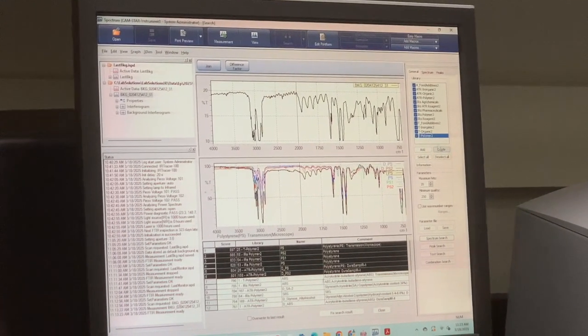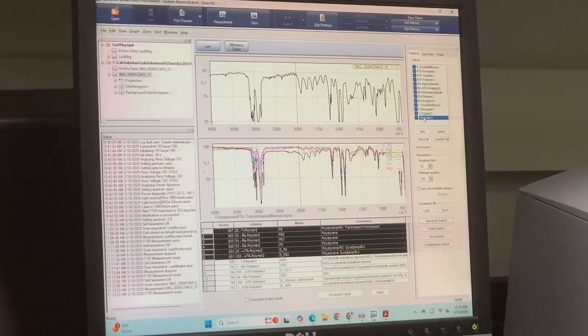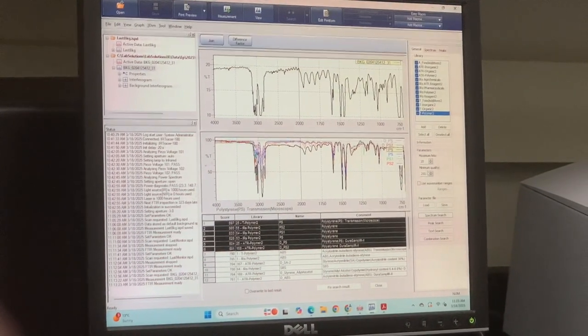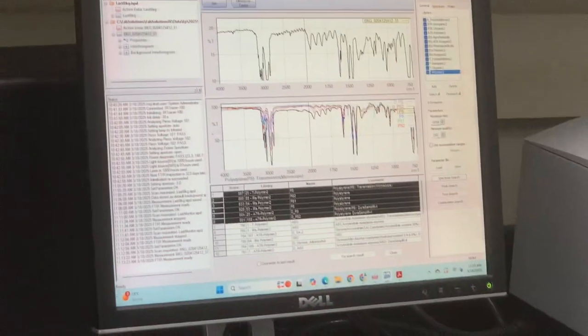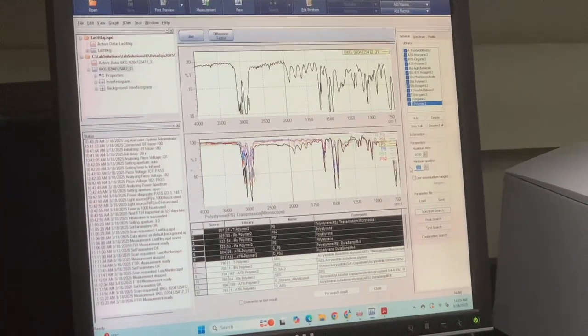So silicon wafer, I think it's some kind of common material being used, right? I would think so. But anyway, we can try. Where was the peak? It was matching with silicon, but it's a different material. There's not much inside.